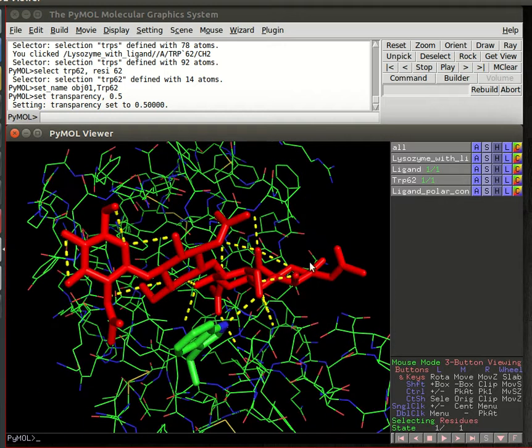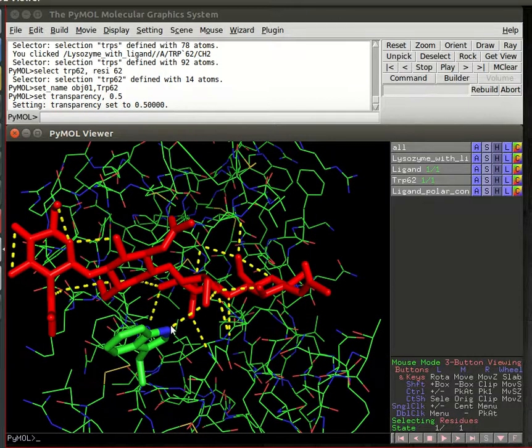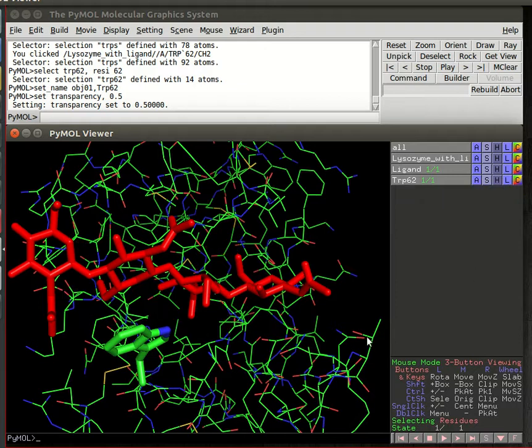So to do that, maybe what we'll do is we'll remove the rest of the hydrogen bonds. Let's keep an eye on which atoms are involved. So there's one here and one here. So let's remove the rest of the hydrogen bonds. So we'll just bloop, get rid of that. Now, rather than at this point starting from the ligand and finding all the hydrogen bonding, let's pick the atoms that were involved and ask for hydrogen bonding from that particular atom.